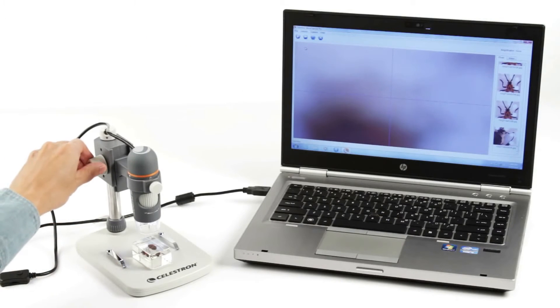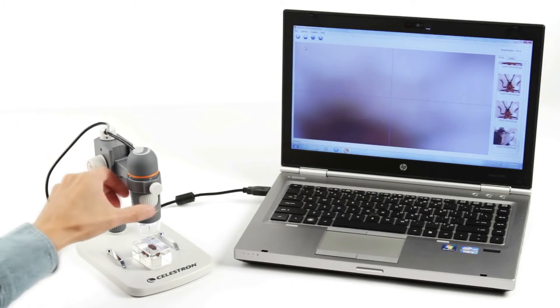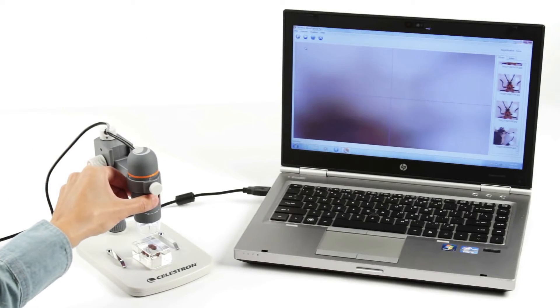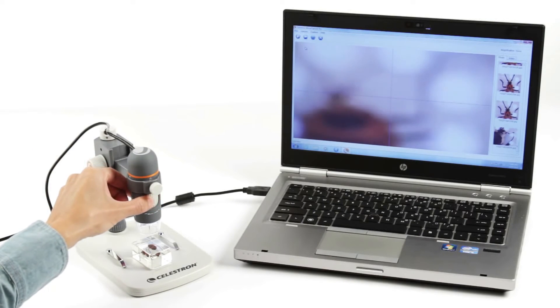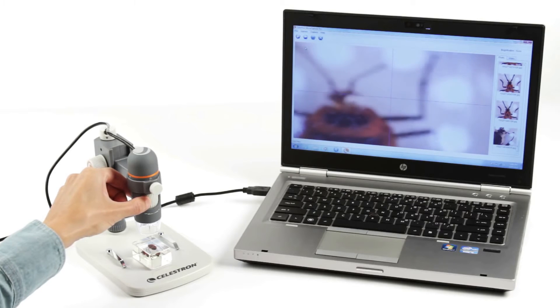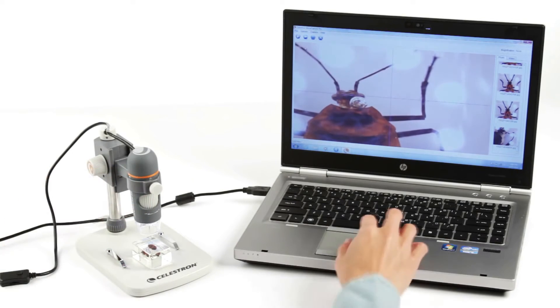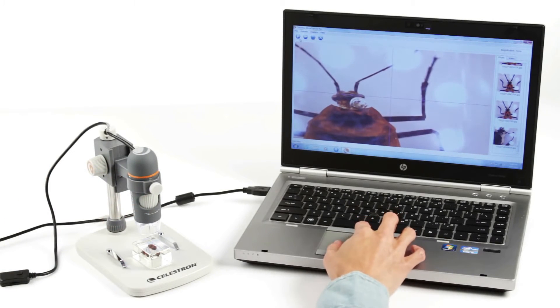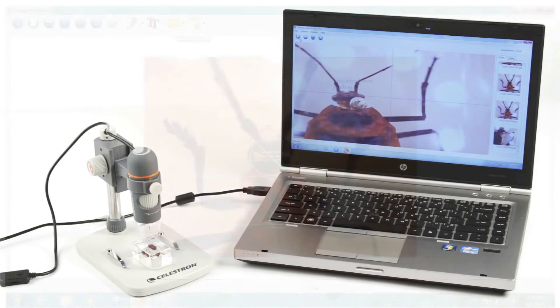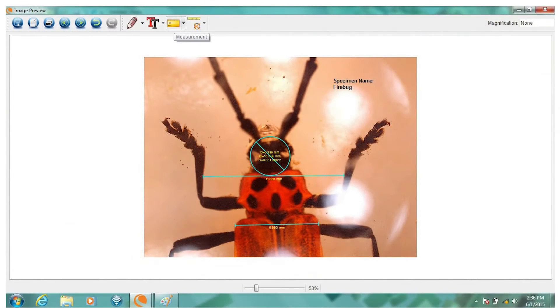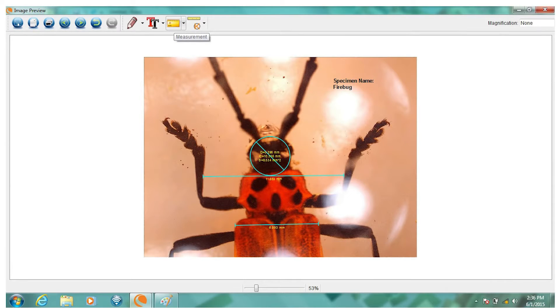Included MicroCapture Pro software for Mac or Windows-based PC is a powerful tool for capturing high-resolution images, VGA video, time-lapse animations, and more. Plus, you can measure the size of your specimens, make notes, and save images directly to your hard drive.